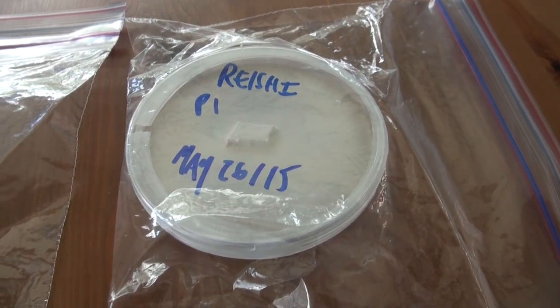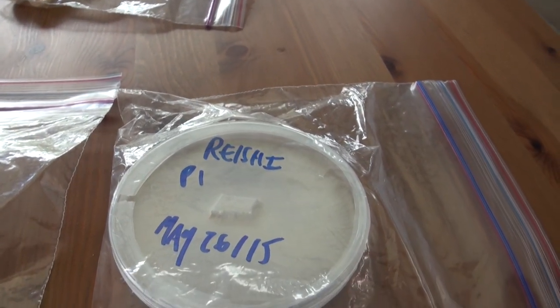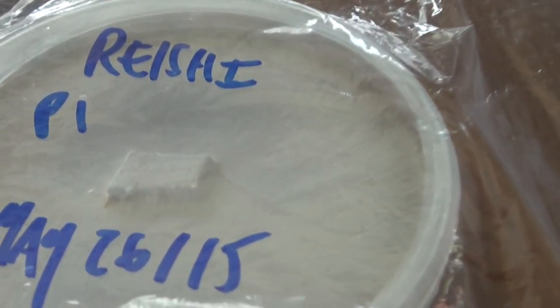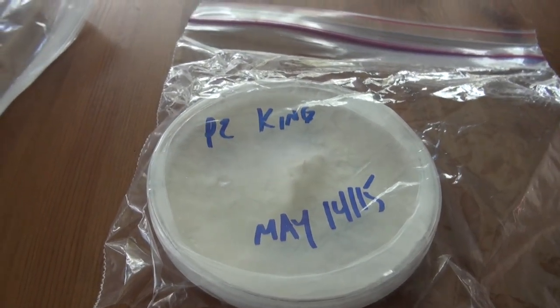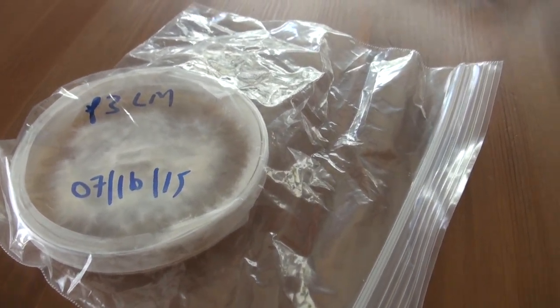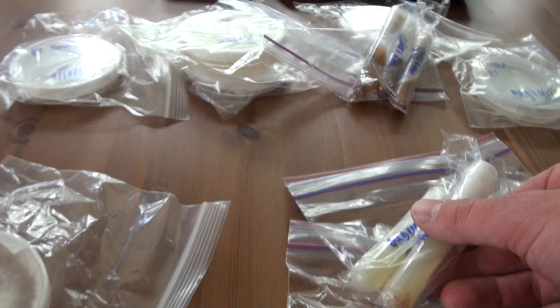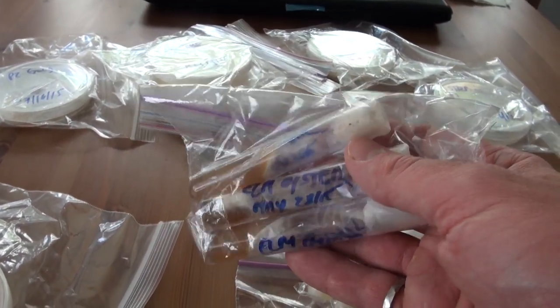Here are a couple of the original cultures that I'm going to be transferring to new dishes. This is a reishi mycelium. We've got some king oysters, some lion's mane, and we also have some yellow oyster and elm oyster saved on culture slants.